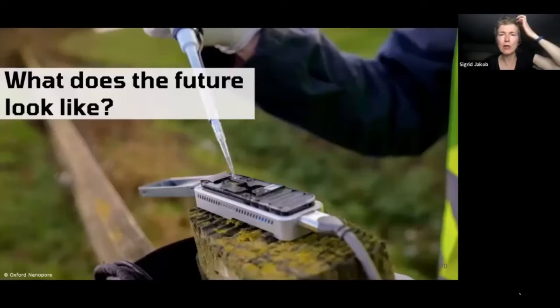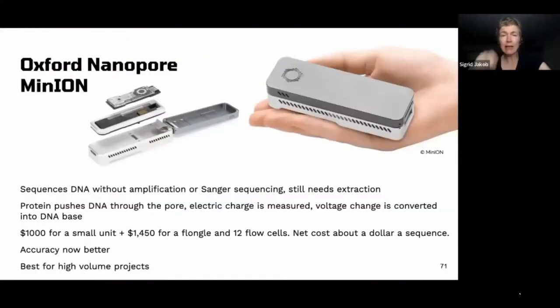Super quick, one quick slide on what the future looks like. The future mostly looks like Oxford Nanopore MinION, which I think is how it's pronounced. It's a tiny little gadget that you can hold in your hand, and it sequences DNA without amplification or Sanger sequencing, but you still need to do extraction. You can take it into the field, you can hook it up to your computer. It gets used a lot by scientists in the field.